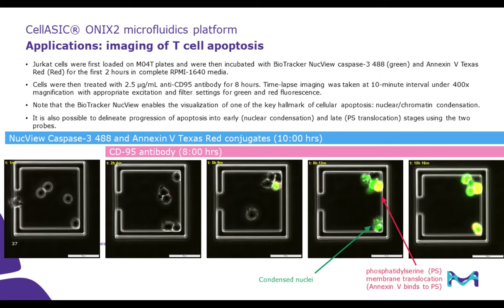Here's another example where we are examining T cell apoptosis at single cell level. We are using CD95 activation to induce programmed cell death and then visualizing the cellular events using a Caspase-3-specific apoptosis probe as well as Annexin-5. Let's take a look at the live cell movie.